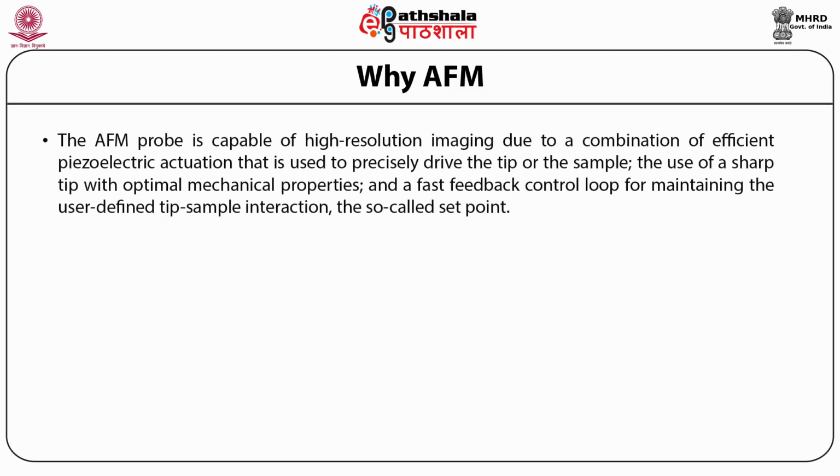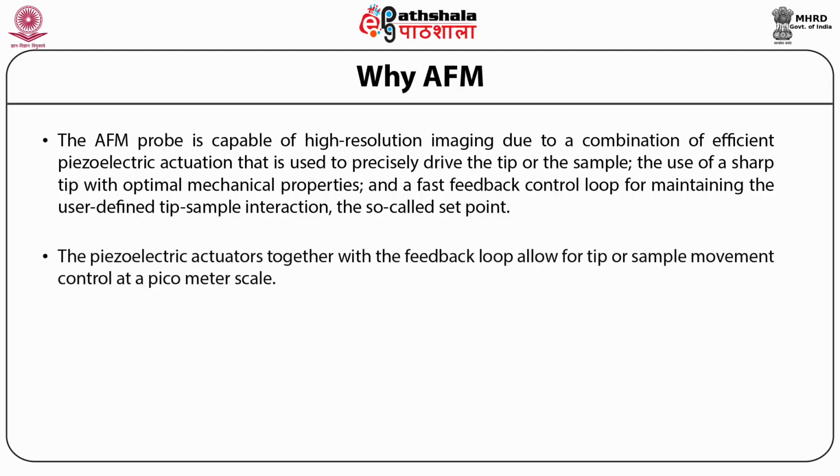The AFM probe is capable of high resolution imaging due to the combination of efficient piezoelectric actuation that is used to precisely drive the tip or the sample, the use of a sharp tip with optimal mechanical properties, and a fast feedback control loop for maintaining user-defined tip-sample interaction, that is called set point. The piezoelectric actuator together with the feedback loops allow for tip or sample movement control at the picometer scale.